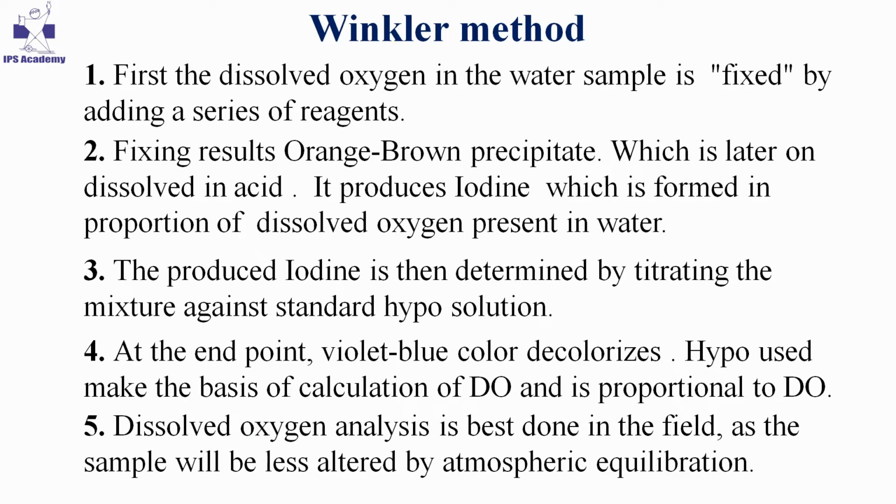Then the produced iodine is determined by titrating the reaction mixture with standard hypo solution. When iodine forms a complex with starch indicator, it produces a violet blue color.